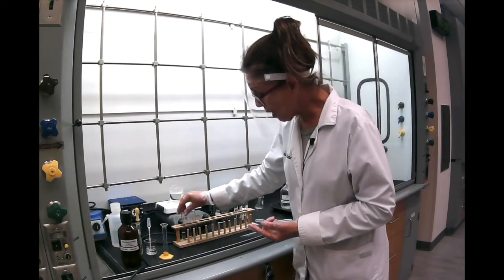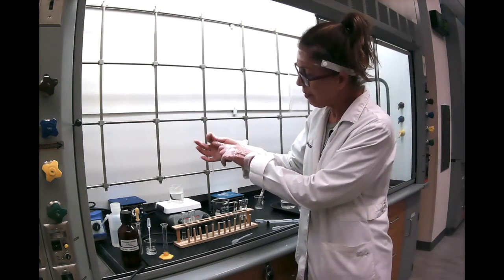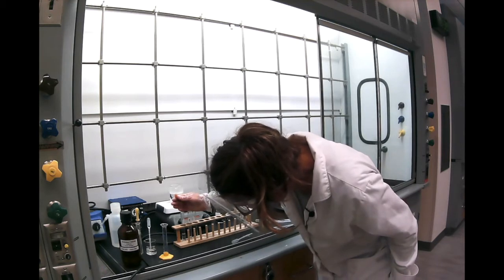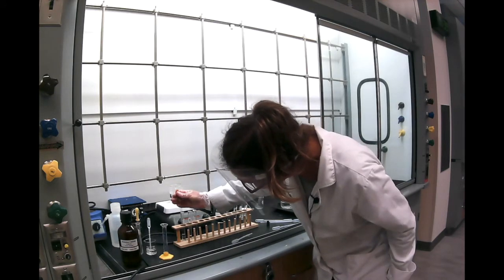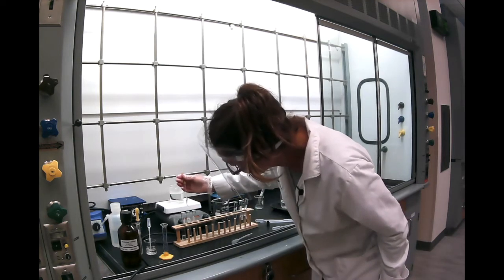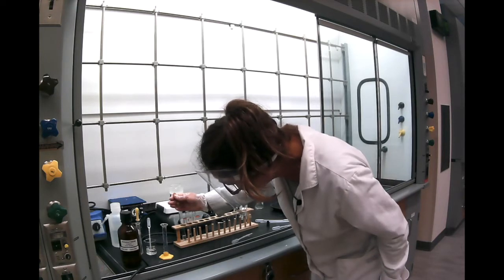Now I'm going to remove the water layer here so we can use a glass pipette. So here, our glass pipette, Pasteur pipette, you have a pipette bulb, you put it on top, and then you put it in your test tube and try to remove just the water layer slowly. You have another tube ready to collect your water layer. Now to have good results, you want to remove all the water without taking away your methylene chloride layer.